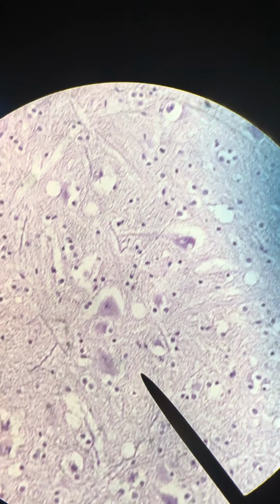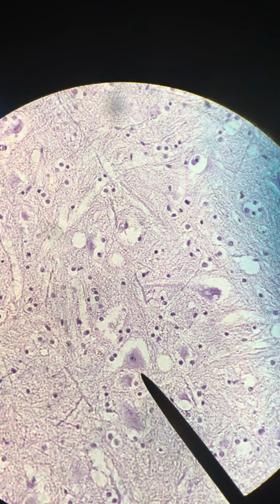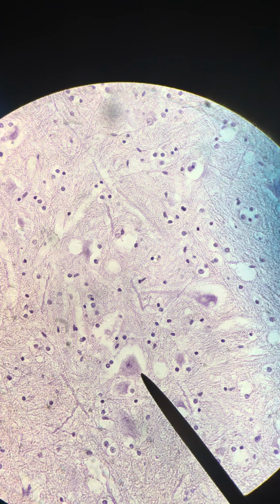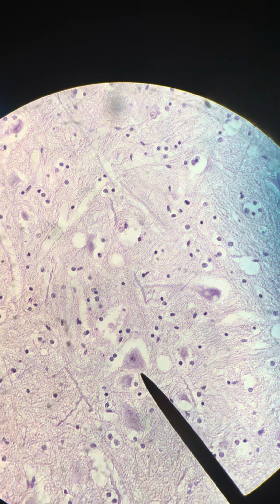So I'm going to come over here and look at this neuron here, because I can make out a nucleus and a nucleolus. This one is sort of a triangular shaped cell body for the neuron. Okay, and I have the pointer on one of the angles, one of the edges of that. You can see also there's an appendage coming off of this neuron right here.